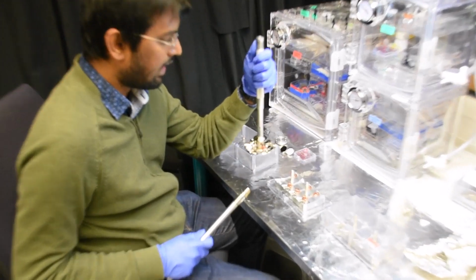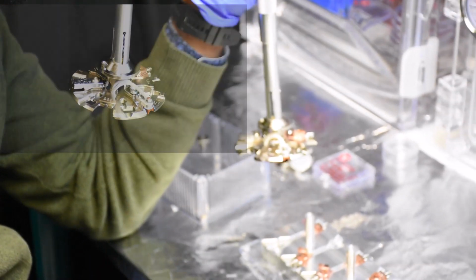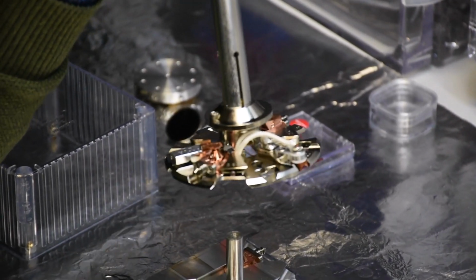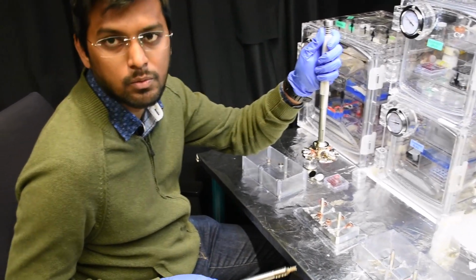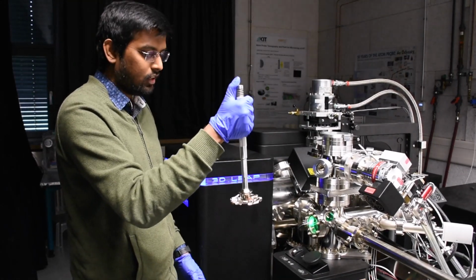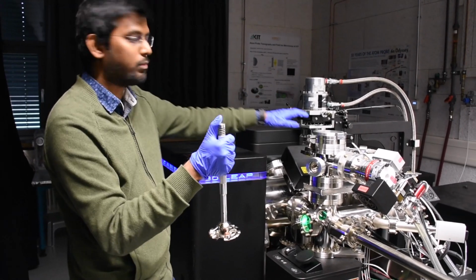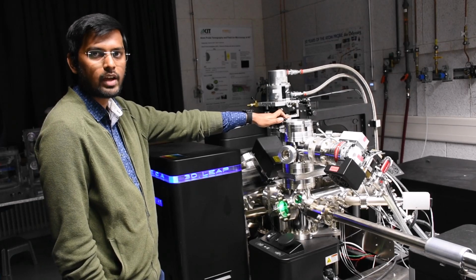So this is the carousel which I was explaining to you about. And we usually load our samples onto this carousel. And we load them like this using a puck manipulator. Once this sample is positioned and locked into our carousel, we load this into the load lock. So once we have loaded our sample onto the carousel, now we will move the carousel into our atom probe's load lock.